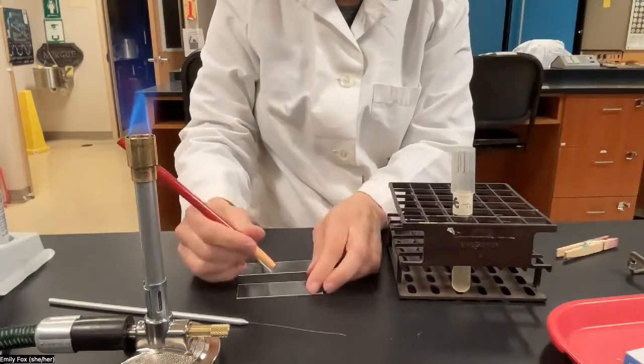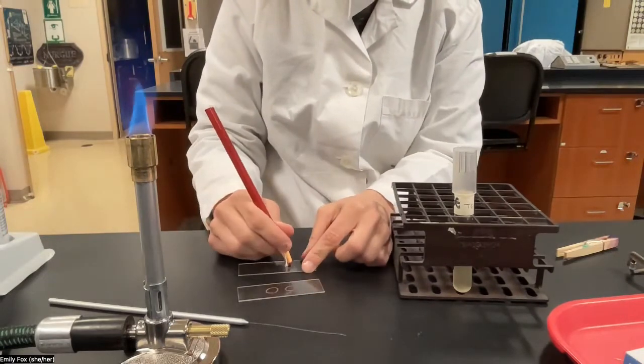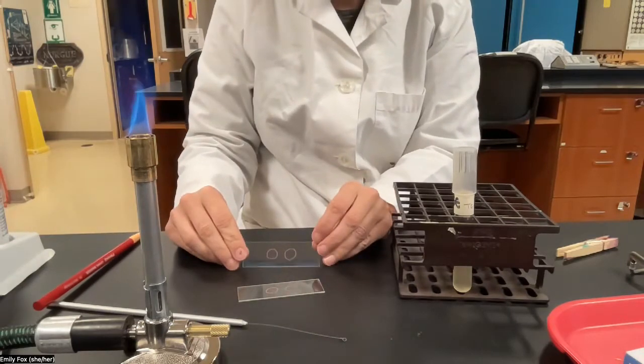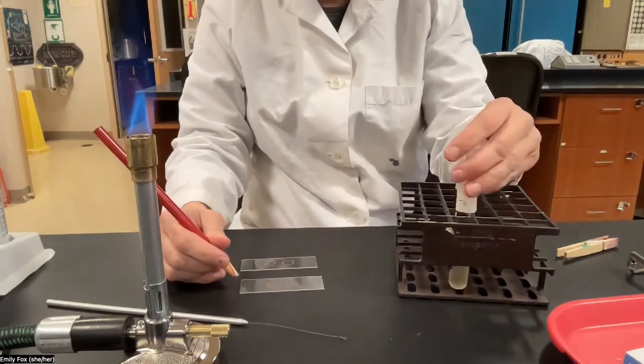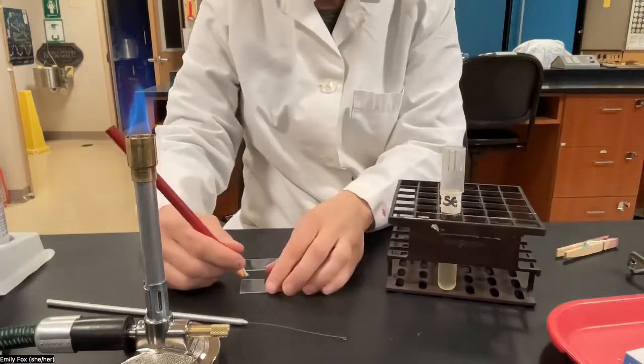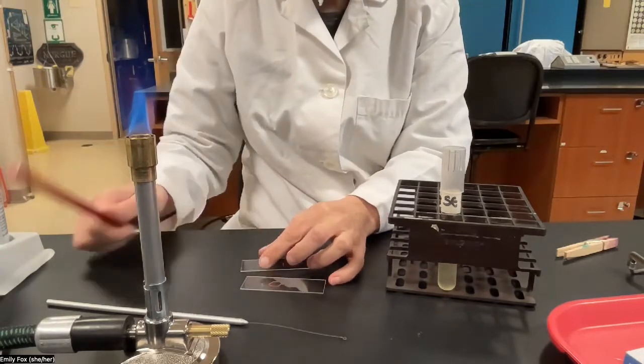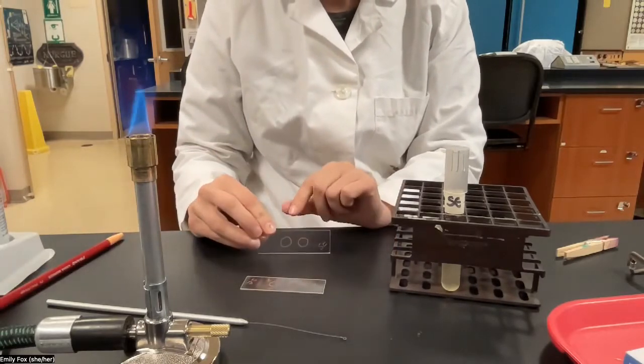Now you're going to take your wax crayon and draw two circles on your slide like this. And then you're going to label your slide with the initials of your bacteria. These are S E. Like so, S E.